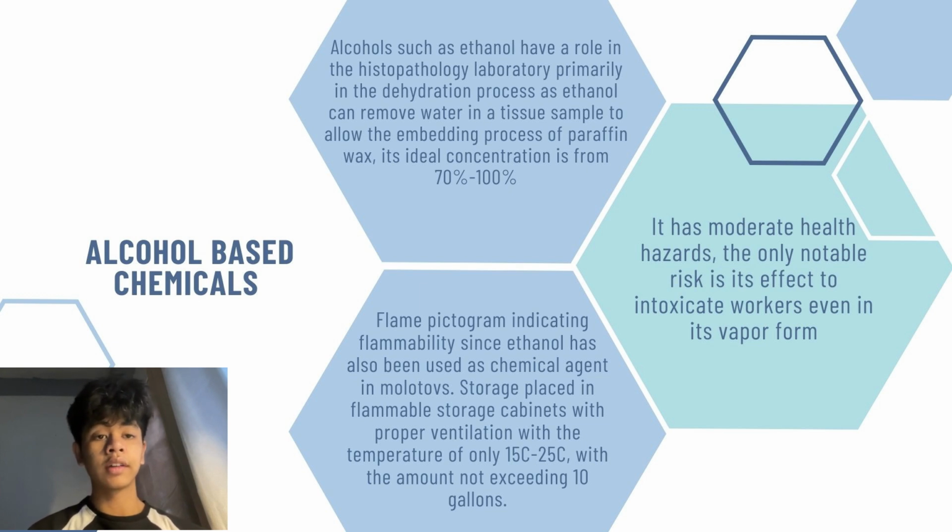The NFPA rating for ethanol is 2-3-0, none, in which ethanol has moderate health hazards.